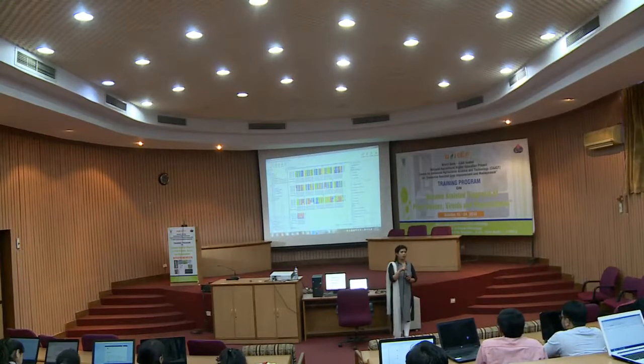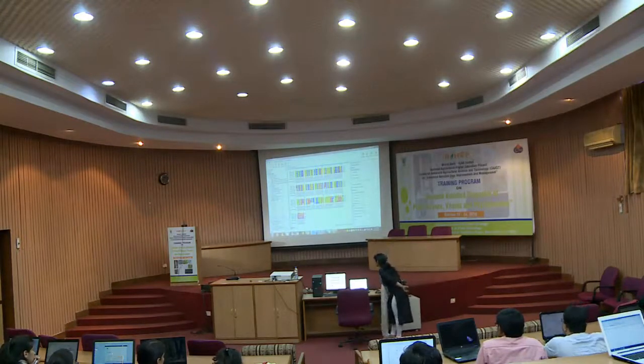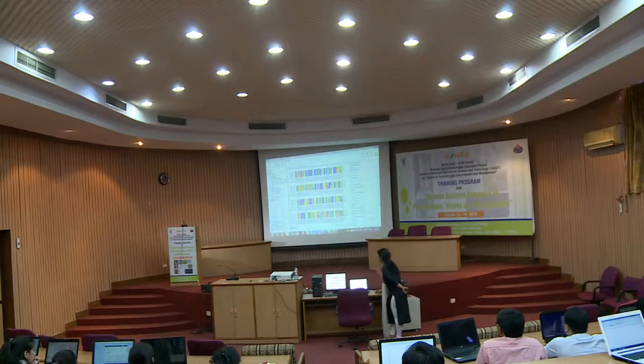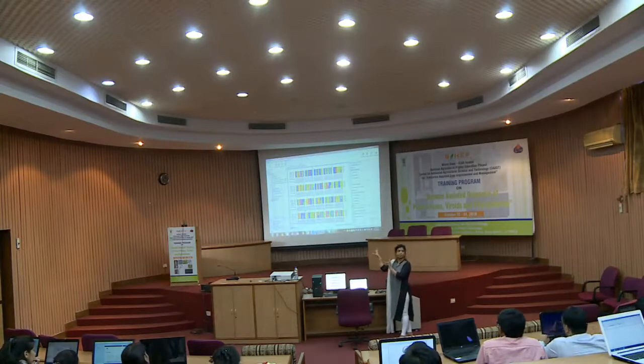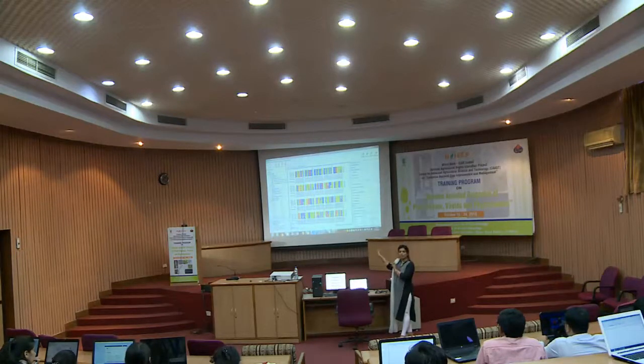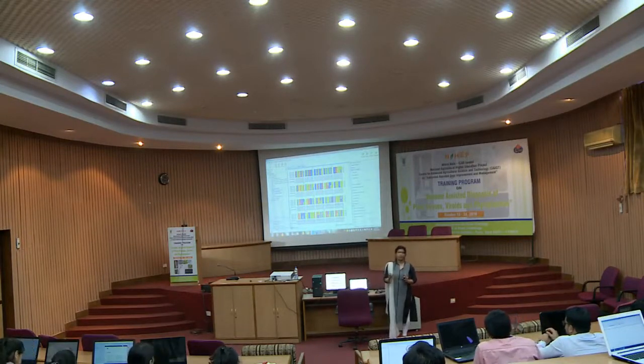So, now you are through with the trimming, you are through with the editing according to the chromatogram file. Please do not do the editing blindly, otherwise you will get confused about which base you deleted, because all seems to be similar only. So, please do not do that. After this, the file which I will be showing you is another file that has already been trimmed and checked, each base has been verified using the chromatogram files. So, now these are ready-to-use files to submit to GenBank, correct. Any confusion up to now?